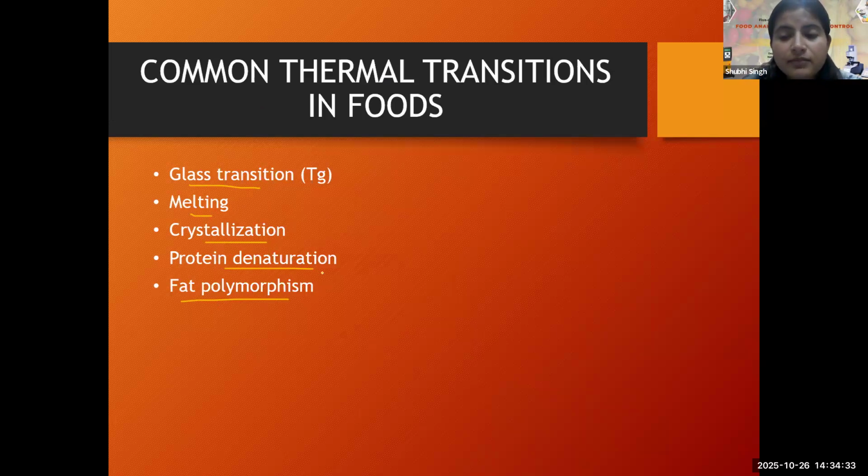When they degrade, they eventually become denatured. So we can analyze protein denaturation also with the help of DSC.